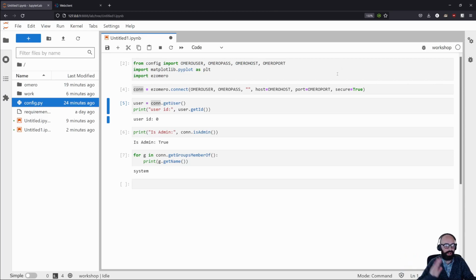One other thing I'm going to add is that at any point, if you need to pause and explore what's going on, that's encouraged. Taking it slow is very much encouraged here. That's part of why I made this pre-recorded workshop, so that you could pause at any moment and explore things and try things out. And you should never feel like you are falling behind.